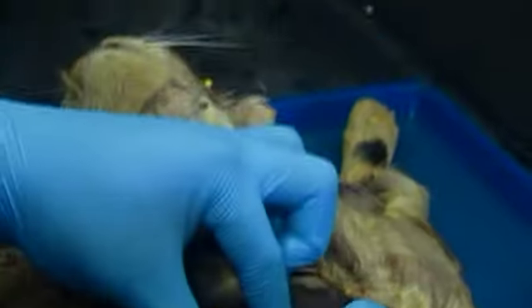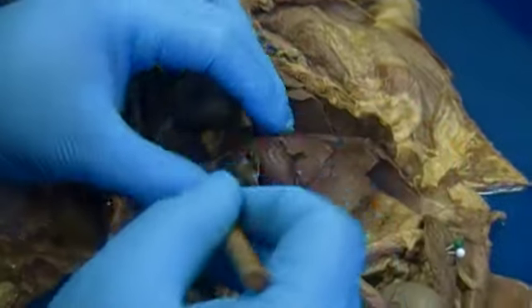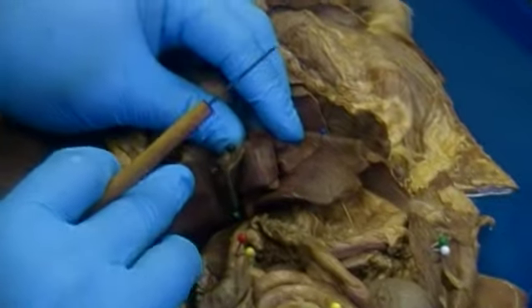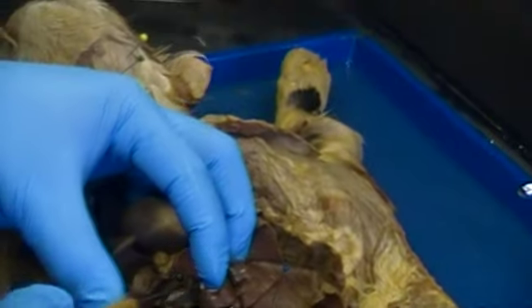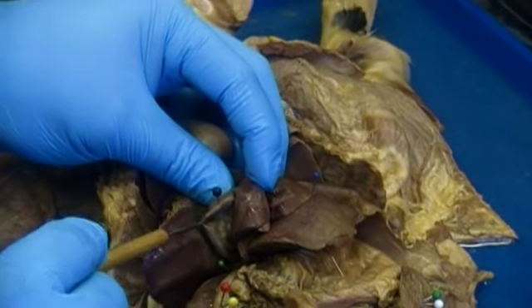Before we get there, I want to talk about this structure penned with a blue pin — this is the liver. Also embedded inside the liver is a sack-like structure penned with a black pin, which is the gallbladder.